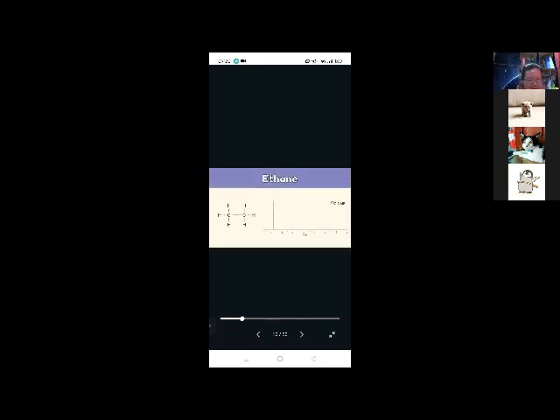Okay. So next, we are going to learn how to identify carbon environments. As you can see on the next slide, this is an ethane molecule. On the right, you can see there is one peak on the carbon NMR spectrum. But what does that mean exactly? It means that it has only one carbon environment.